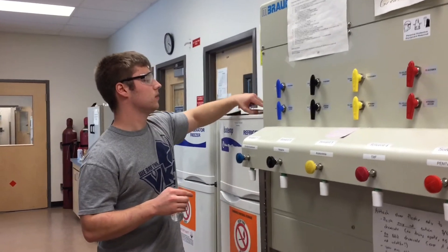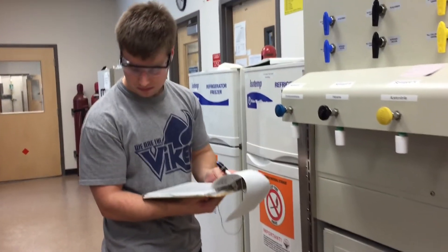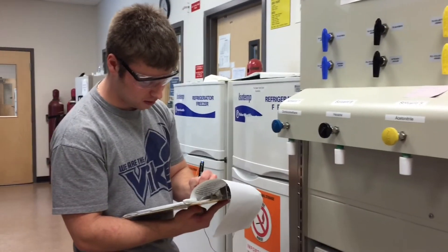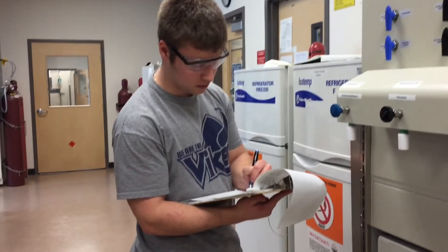Finally, you want to fill in the logbook, which tells you what you took, how much you took, and what group you are in. We are in the Mach and Dough group.